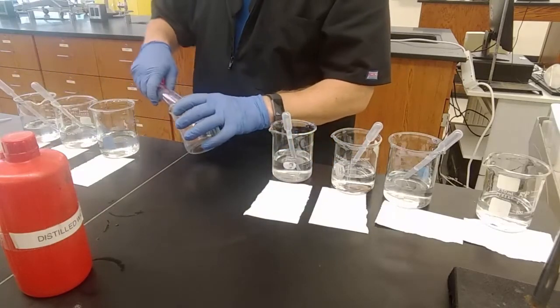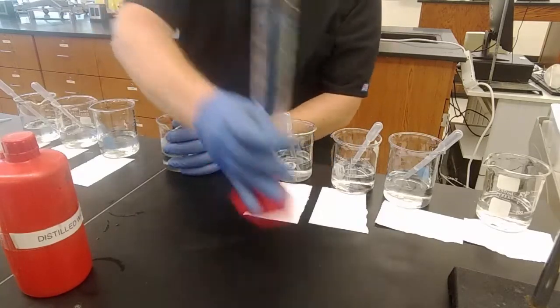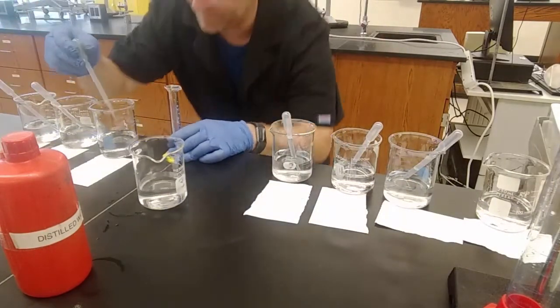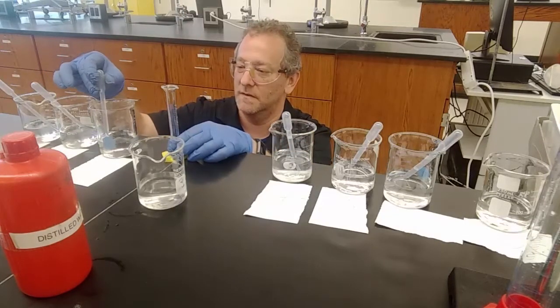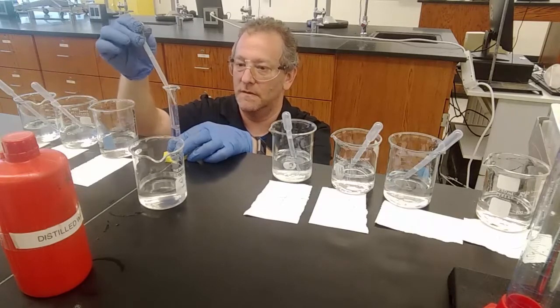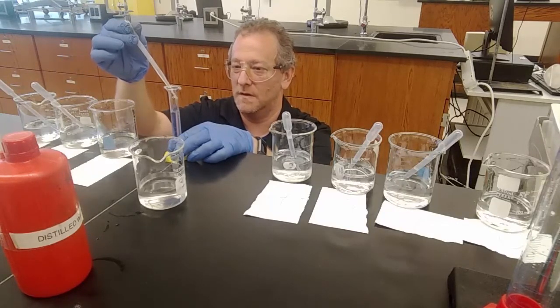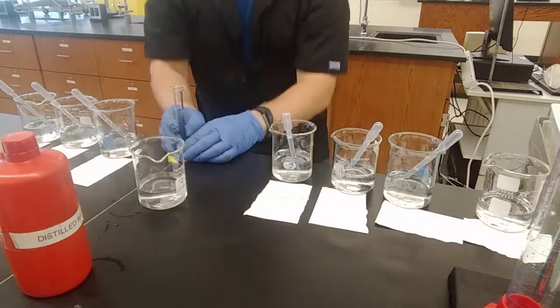90 milliliters of water. 10 milliliters of number 11. In we go.